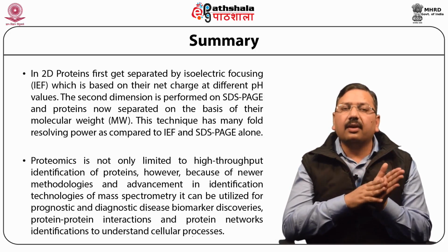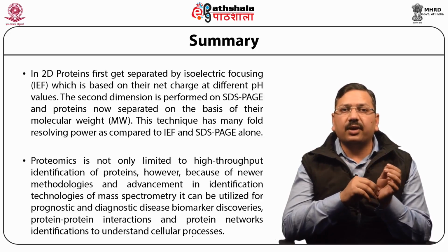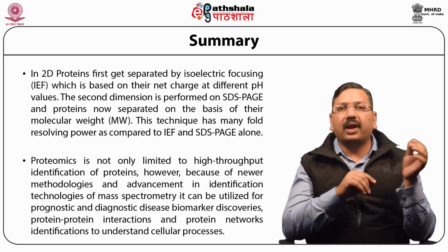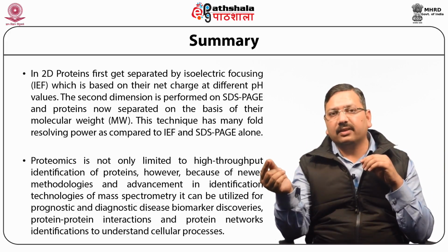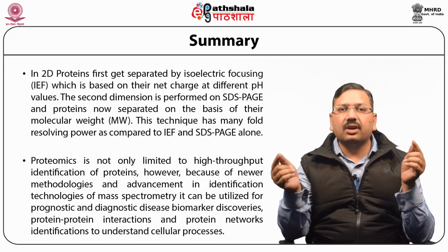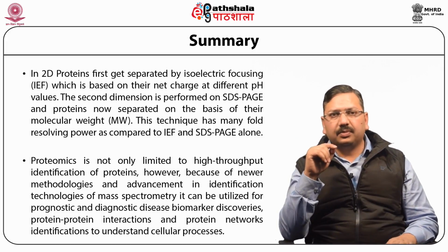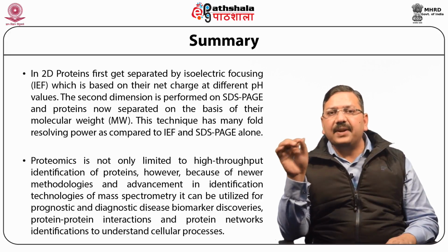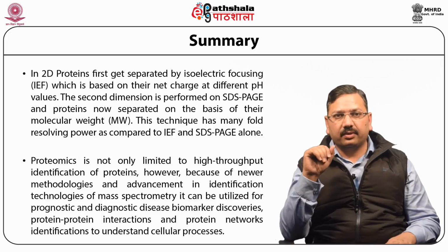This is the workflow by which we get a protein identification, starting from our SDS-PAGE analysis or our 2D PAGE analysis, and lastly it will reach up to the level of mass spectrometry. But there are certain limitations associated with gel-based proteomics.